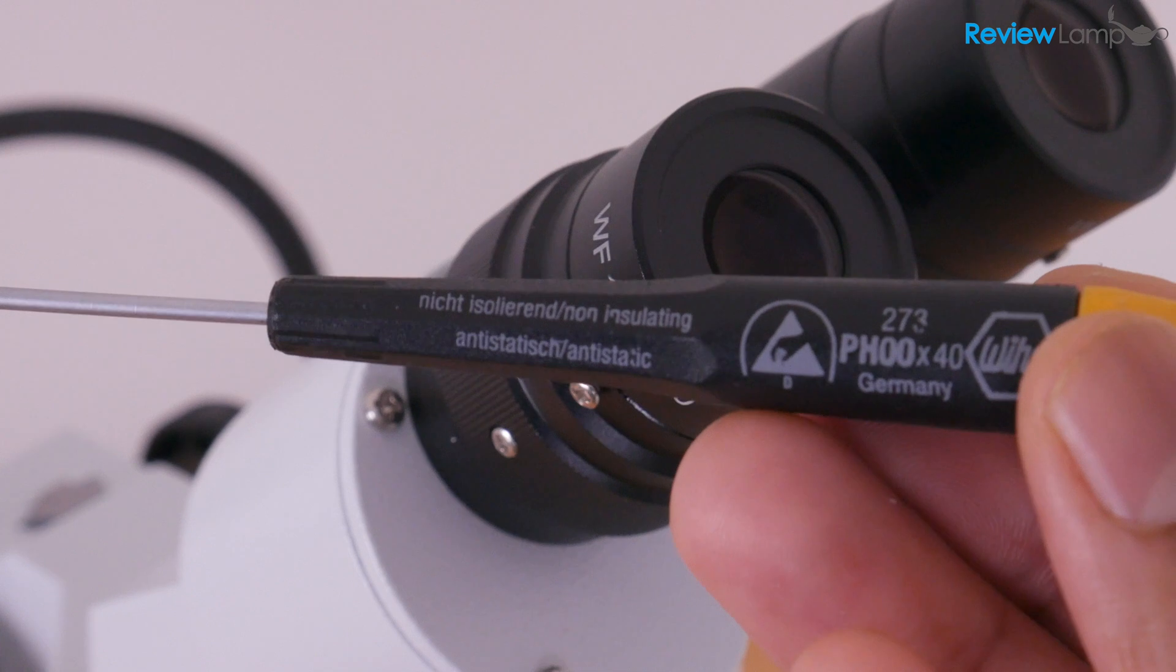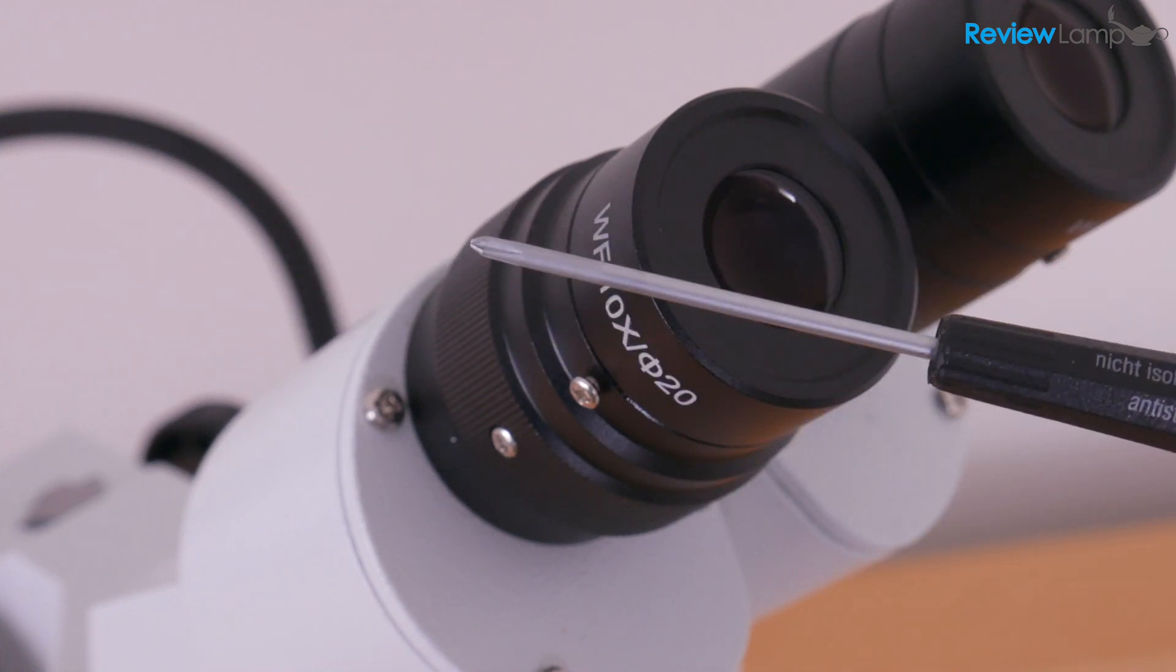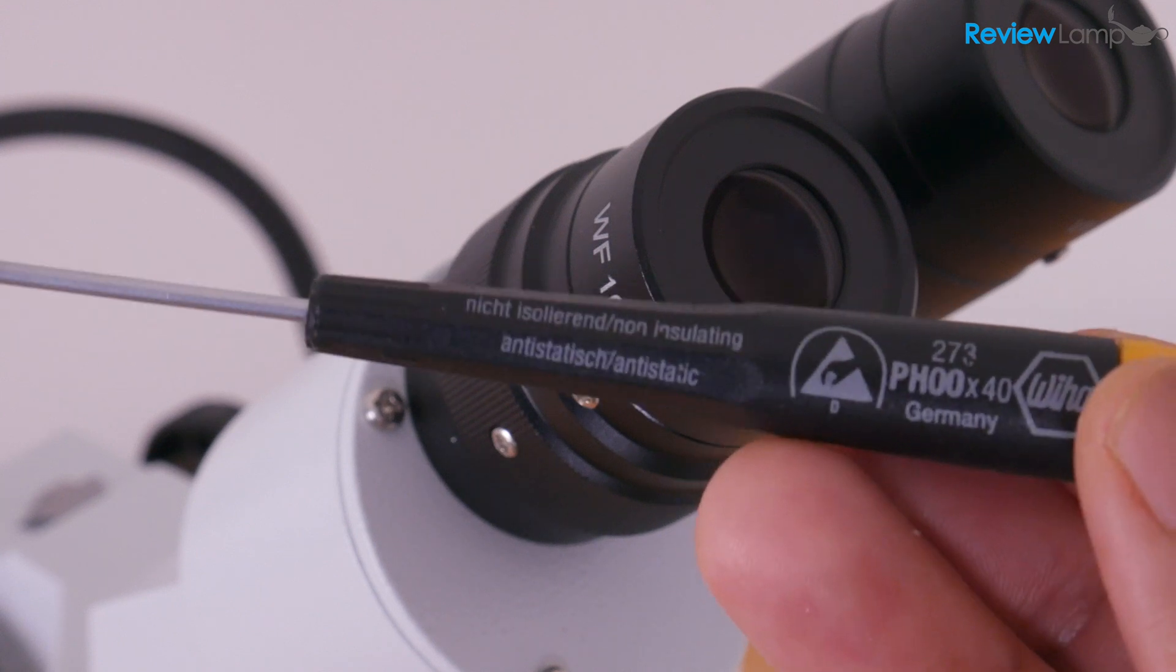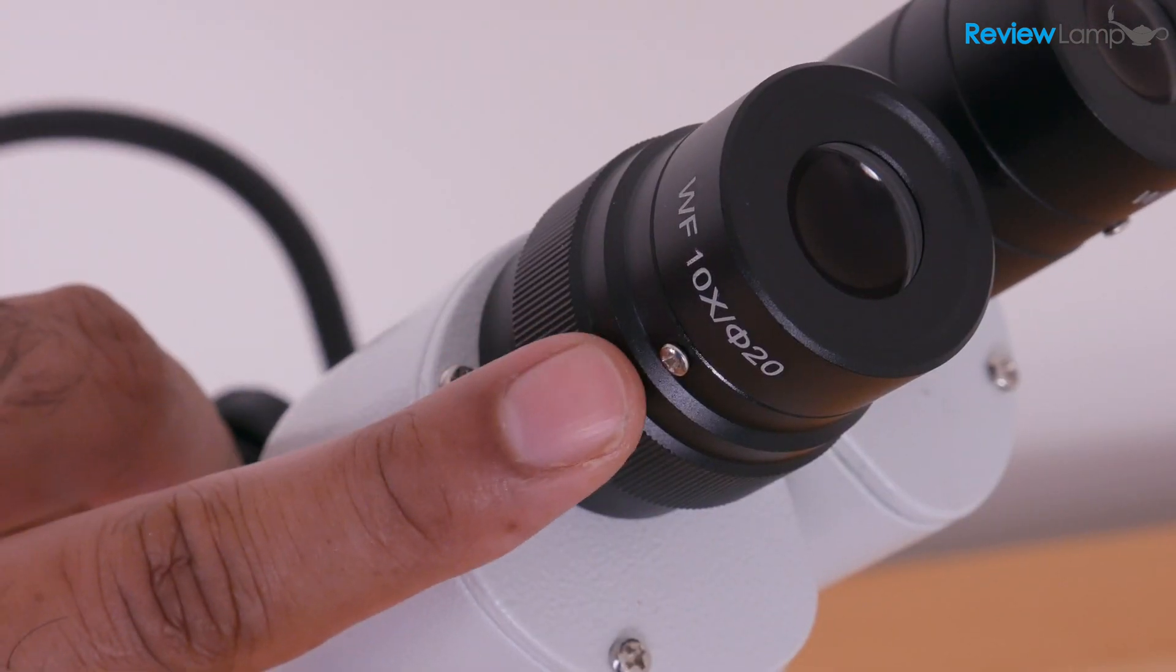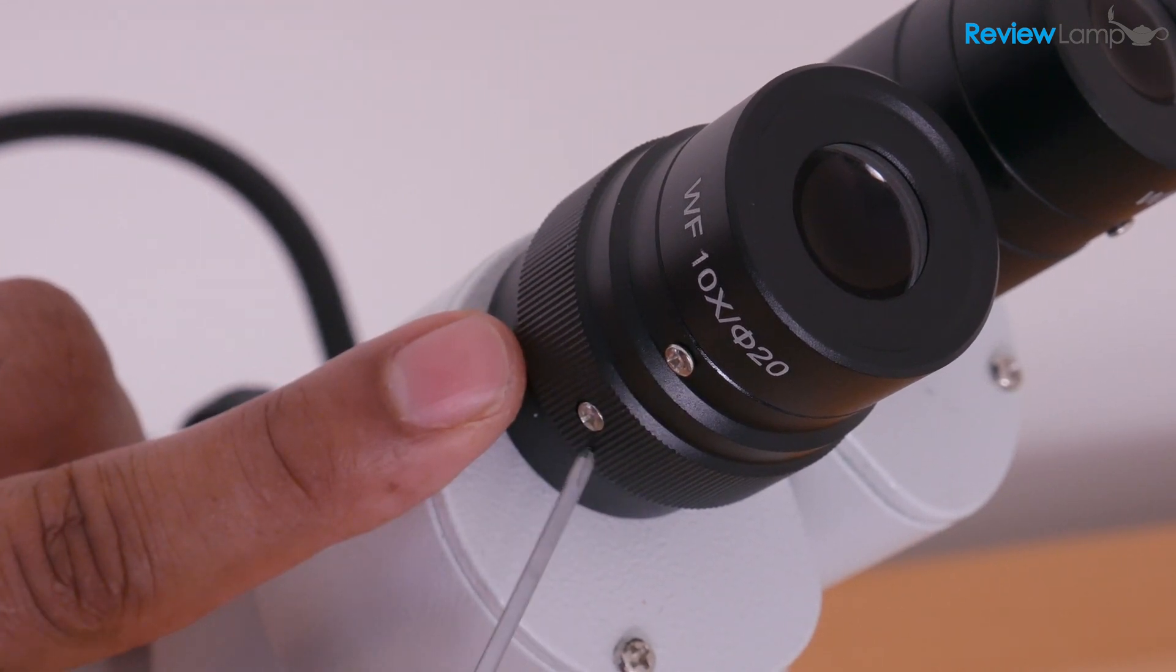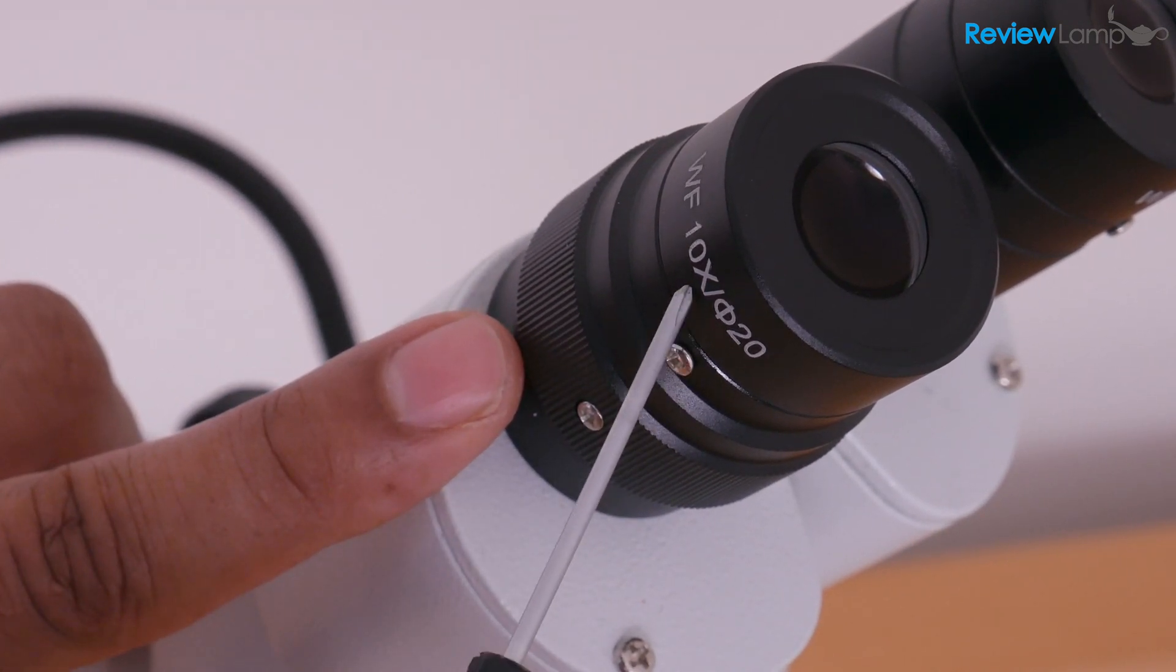And to do this, you're going to need a Phillips head double zero screwdriver. And this is a pretty fine screwdriver. If you don't have one of these, I'll leave a link right below the video. So feel free to check that out. And with that screwdriver, you're going to unscrew the topmost screw, that is the screw that is closest to the eyepiece.